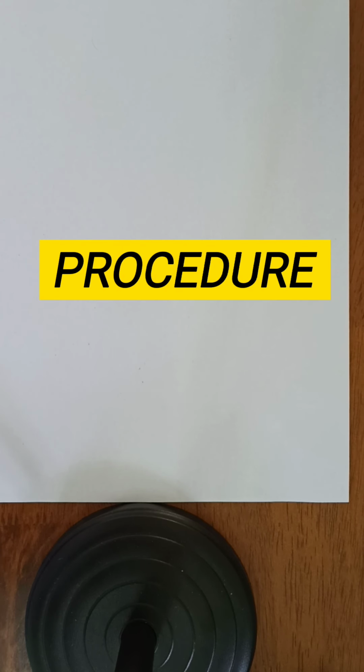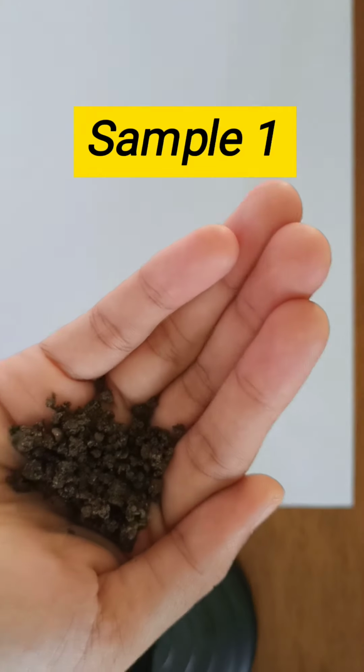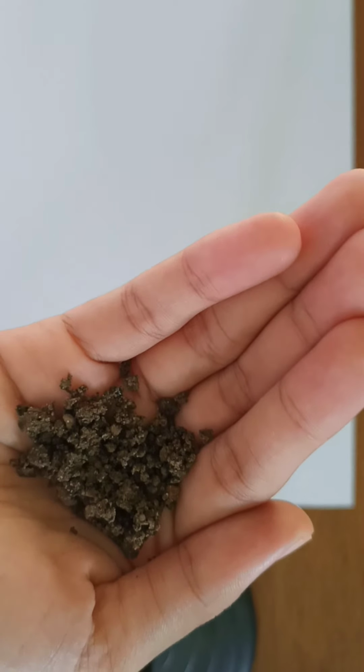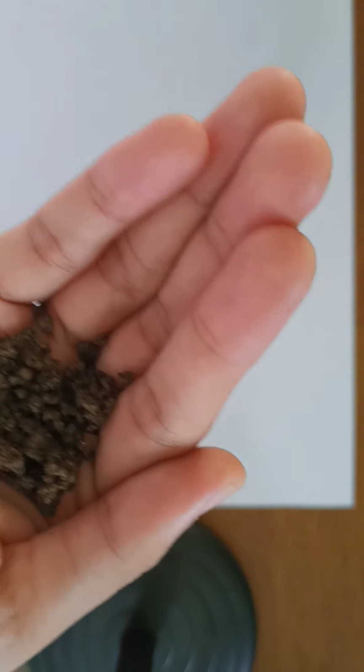Okay, for the soil color experiment, the first step to do it, add a little sample of soil into your palm and add a little water.